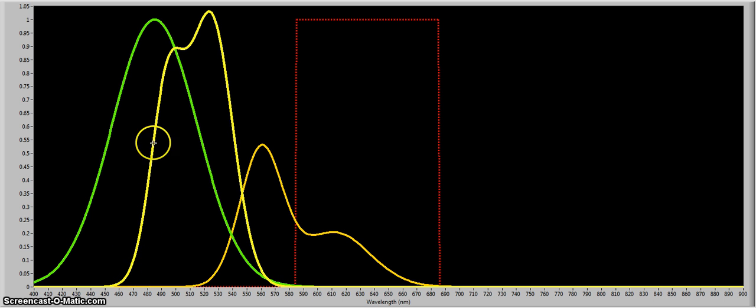At this point, we have our chromophore, which is going to absorb the energy from our LED. We have the fluorescence that's going to result from that with the associated absorption cross-section and quantum yield, or quantum efficiency, that we mentioned earlier. And then we have the notch filter. What remains is the impact of the actual detector. And the detector in our instance is a full color CCD, and that CCD has a sensitivity or responsivity that is variable on the wavelength.